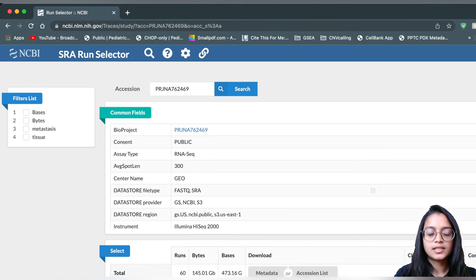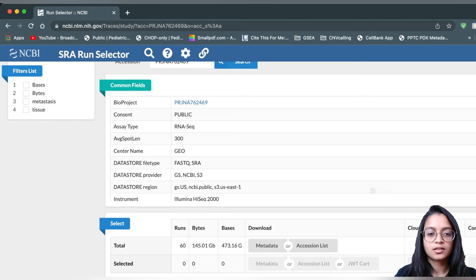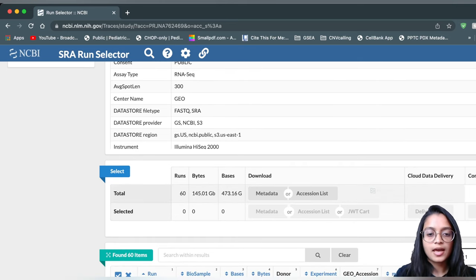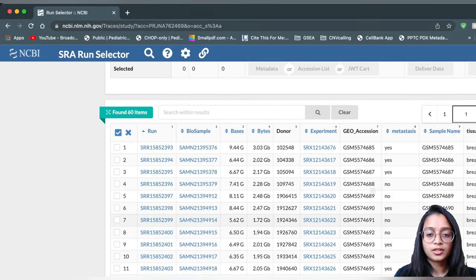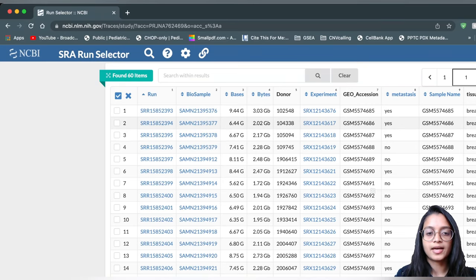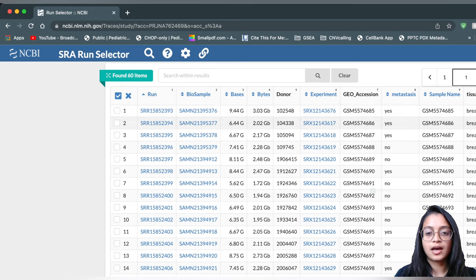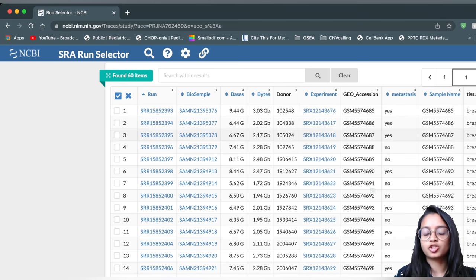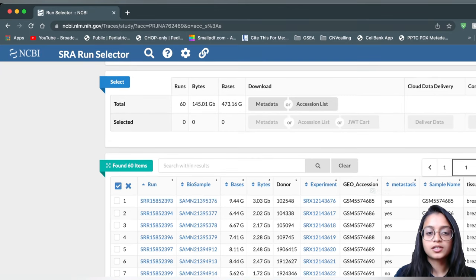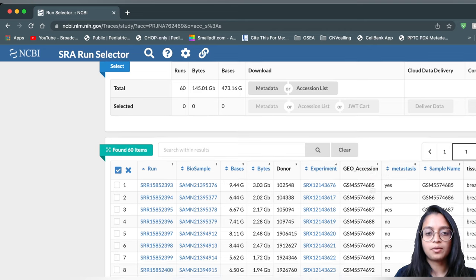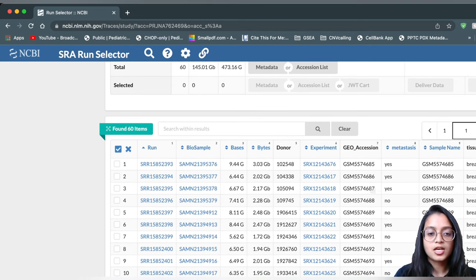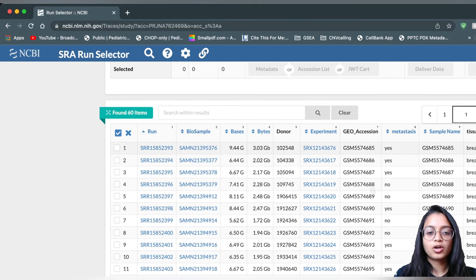When you click on SRA Run Selector, a page shows up containing information about the project, including the runs, bytes, and additional information, along with a download option. Scrolling further down, you can see a full table with SRR IDs associated with the samples, including donor information and associated experiment IDs starting with SRX. We see 60 runs here because we have 30 pairs of tumor and normal samples, with each sample corresponding to one run.